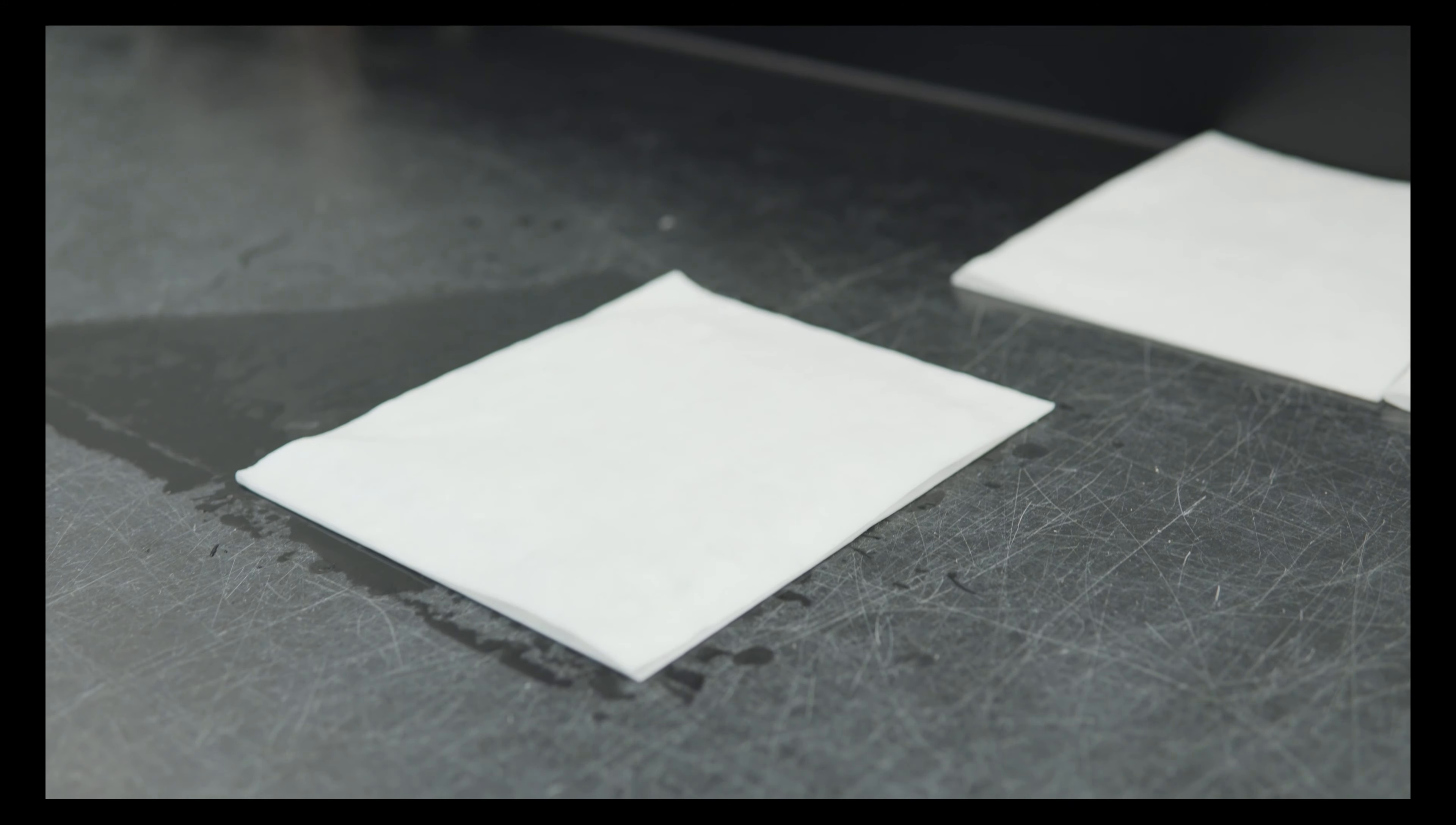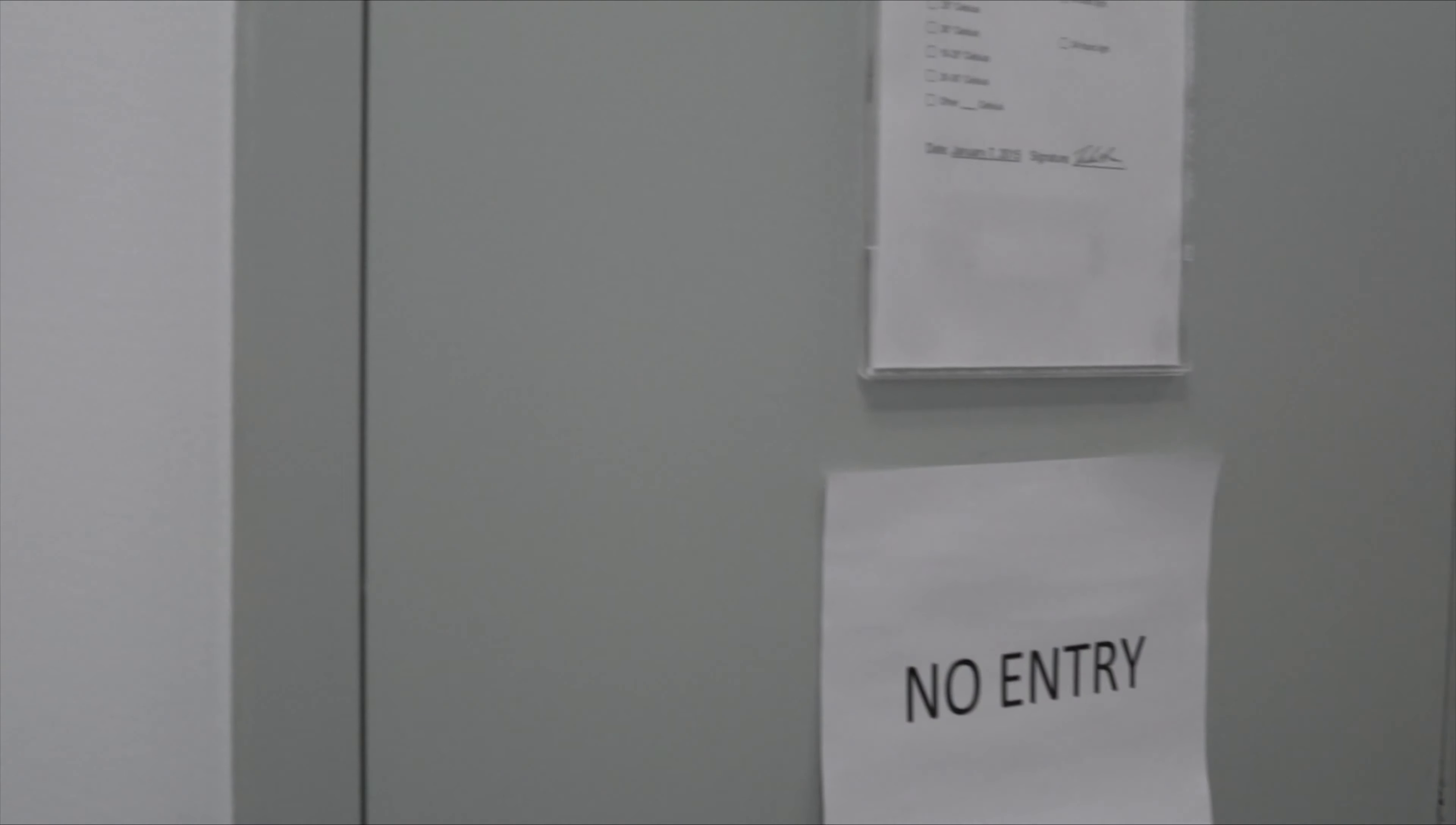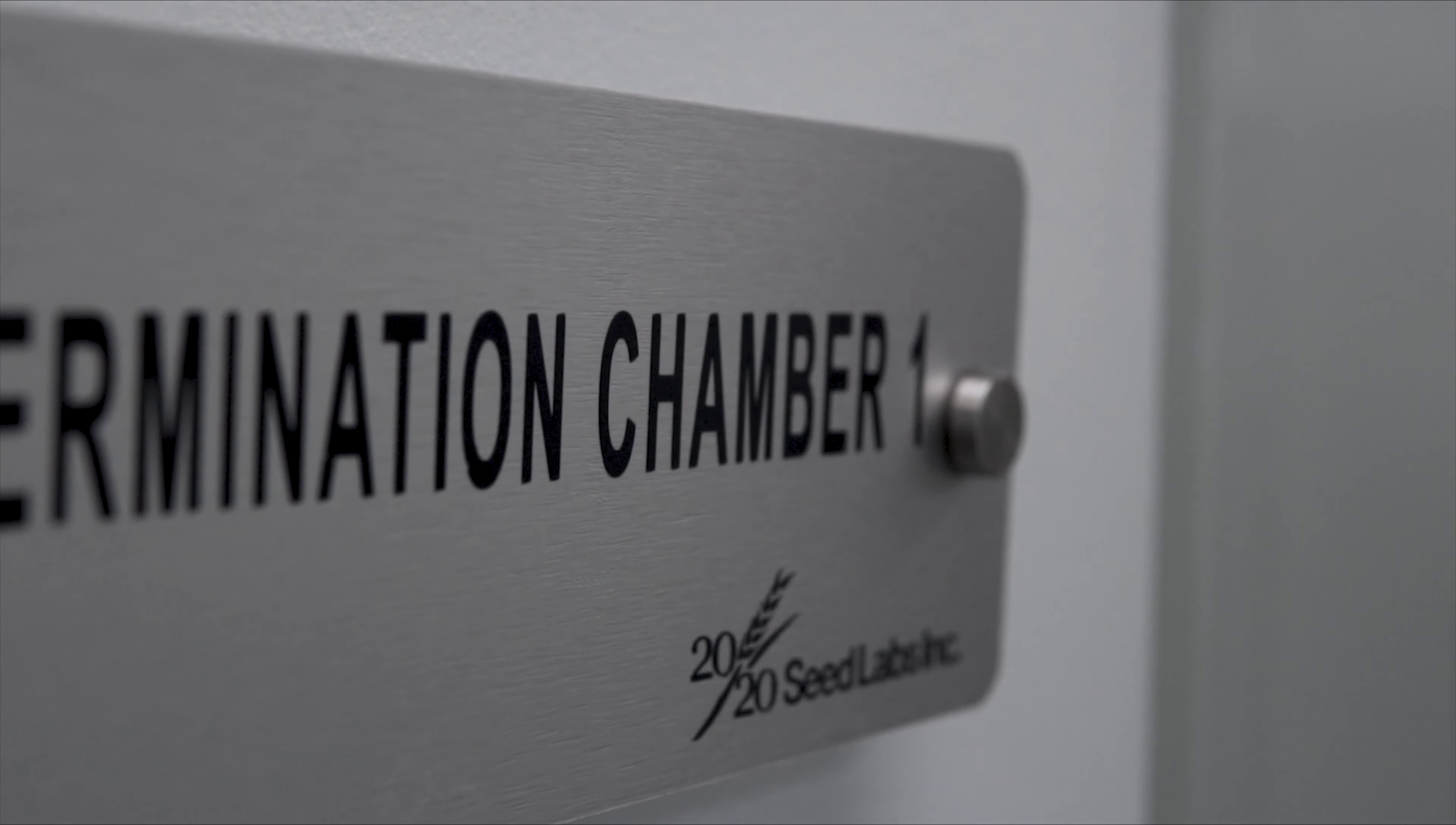This process is repeated for a second time and repeatedly until 200 seeds are planted separately in Canada and 400 seeds are planted separately for the international seed testing rules. The sample is then folded into a paper envelope, covered with a plastic bag, and placed into a pre-chilled chamber for four days and then moved into the germination chamber.